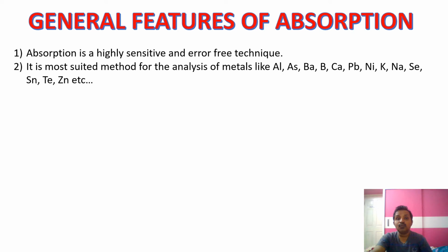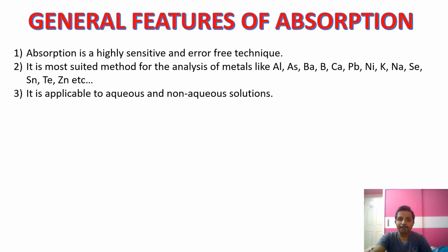This is one of the suited methods by which we can analyze all these elements. The next point is it is applicable to aqueous and non-aqueous solutions also. It requires very little time, and it gives very exact results.